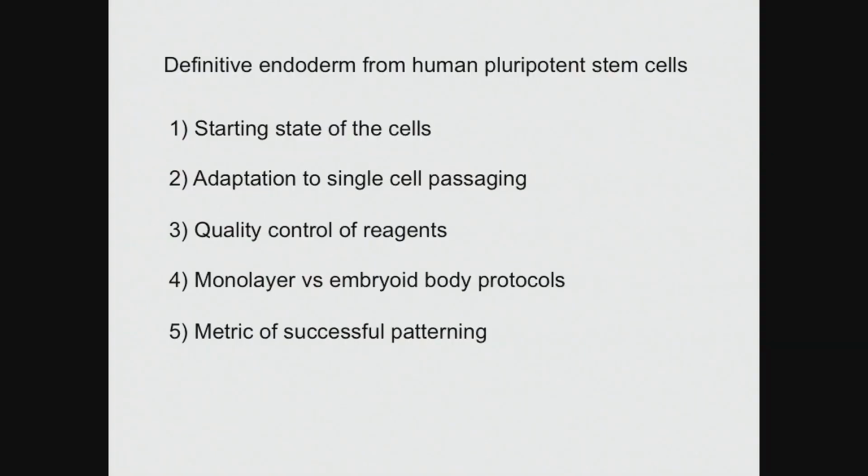And sadly, it turned out for me that after all that time, we got in a new batch of activin, and lo and behold, the next day, my percentage was 90%. So there are so many variables in these protocols. The protocols definitely work. So if you're not getting good efficiency, there's a problem.